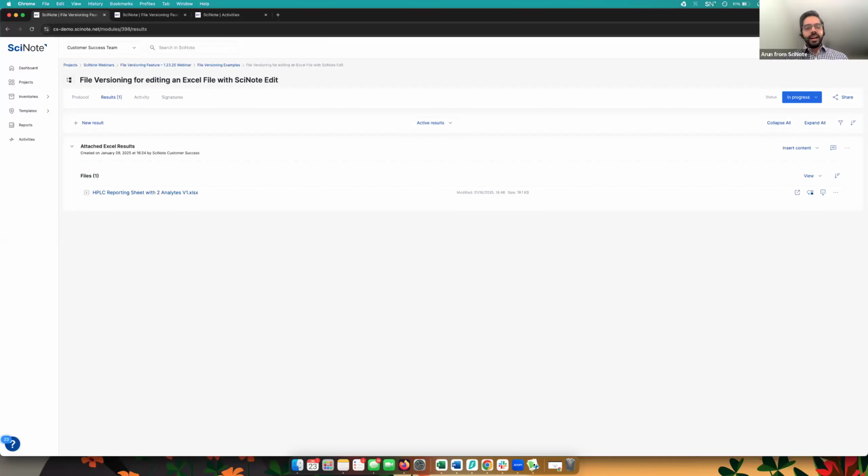Awesome. So today's webinar is going to be focused on our file versioning feature, which we introduced at the end of last year. It was a much requested feature by a lot of our users. And the goal of this feature is primarily aimed at bolstering your compliance requirements. So as some of you that are familiar with SciNote might know, we have an audit trail that tracks all your changes that you make directly in the SciNote application.